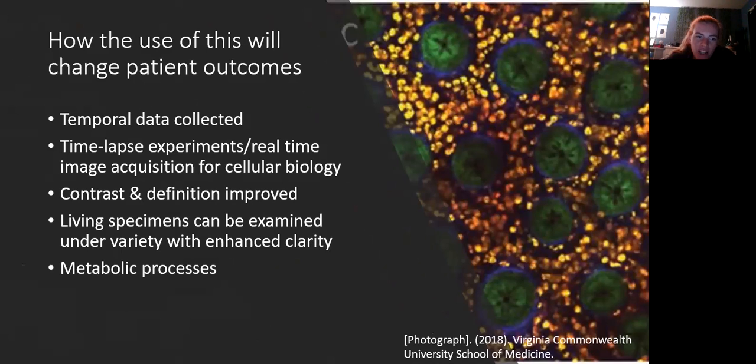For patients, they are able to look at this data in real time. Through the multiple scans and then being able to pinpoint certain proteins and then create these 3D structures, doctors are better able to diagnose and track their patient's progress, so that they're able to change their care plan as needed.